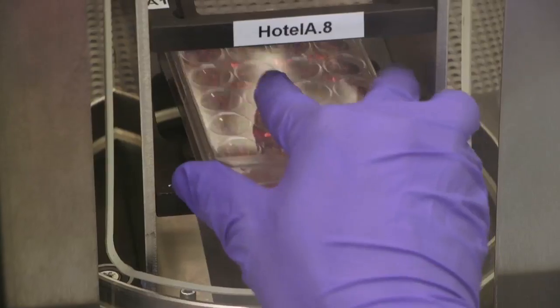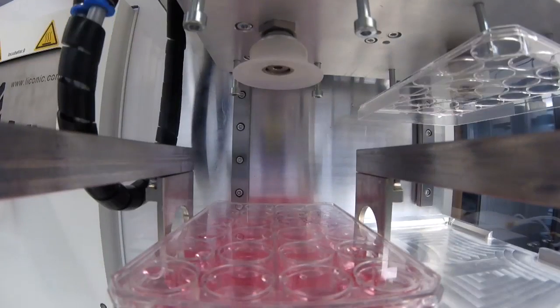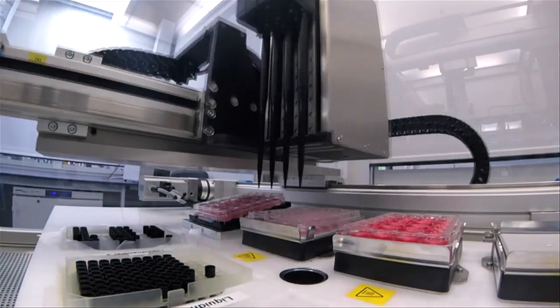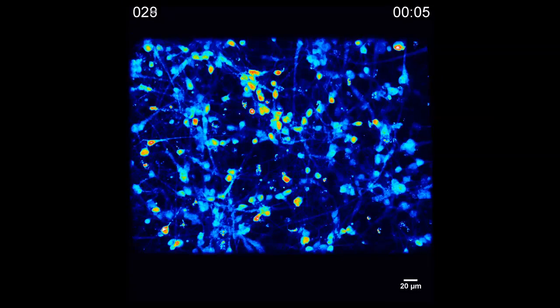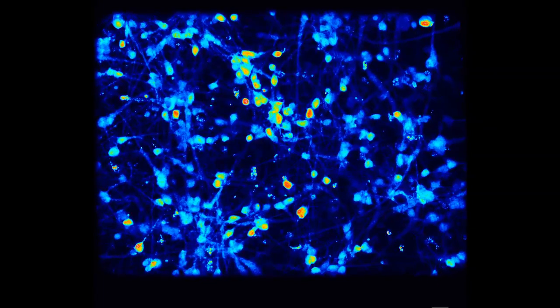Parkinson's is a disease that develops gradually. The researchers are therefore cultivating neurons over relatively long periods in another specially developed system. In it, 96 cell cultures in tiny channels can be tested simultaneously and fully automatically. The aim is to better understand the chronology of the disease's many different symptoms.